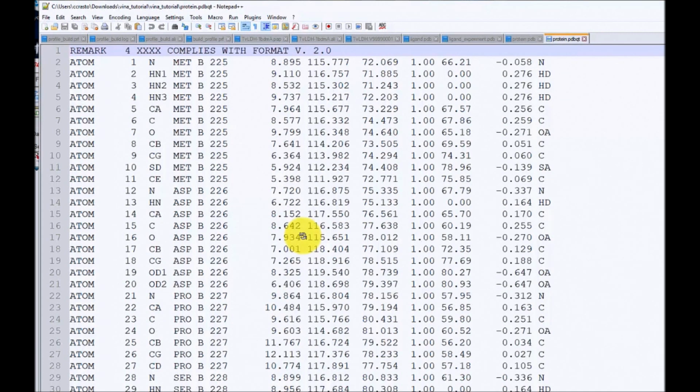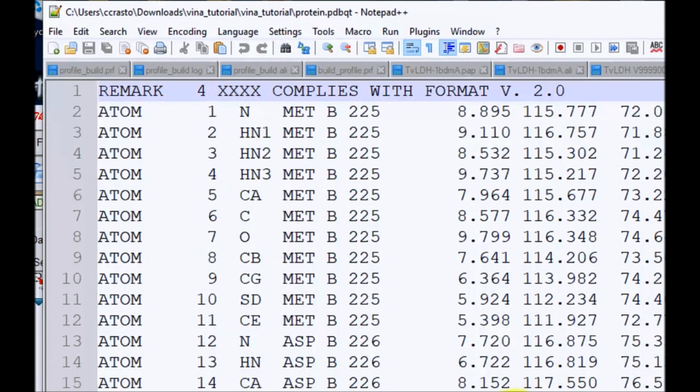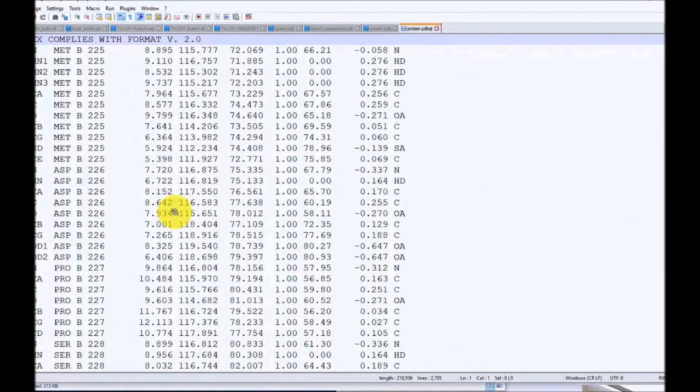What else does he have? Now they put in the hydrogens, right? So now the protein data bank, the PDB format, has changed, and once again this is a kind of idealized hydrogen representation based on what we understand in terms of the tetrahedral geometry, or trigonal, or pyramidal geometry, etc. Now, this is the only difference. This is another column that's added, and it seems as if there's some sort of a charge consideration here. And Q is the kind of the universal.